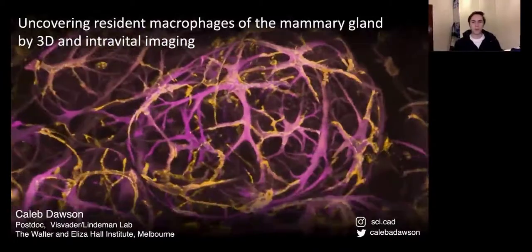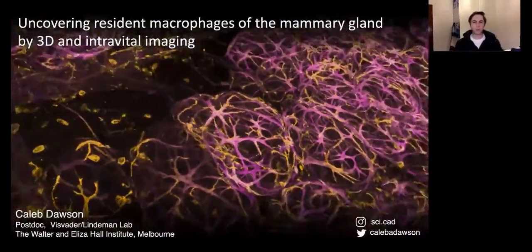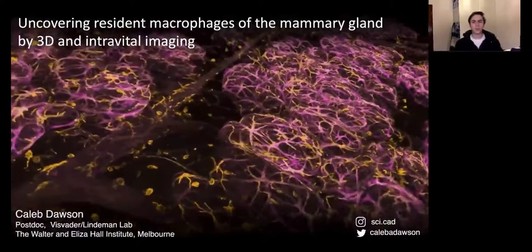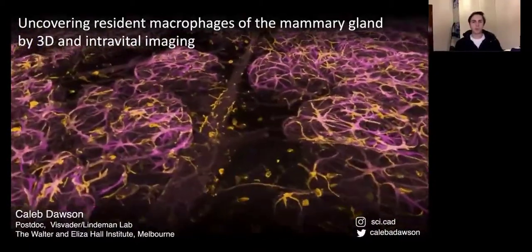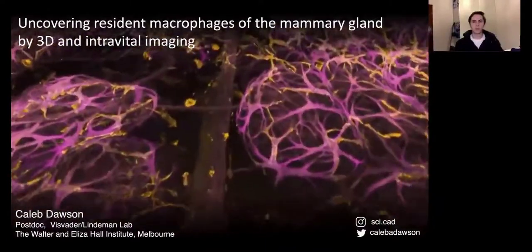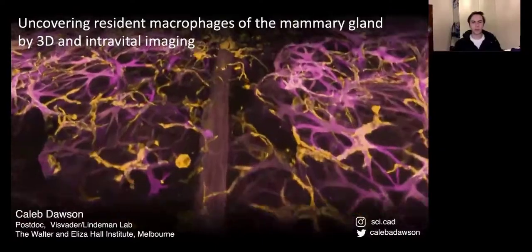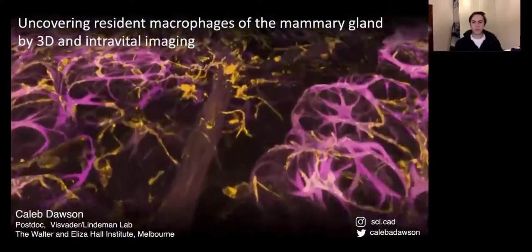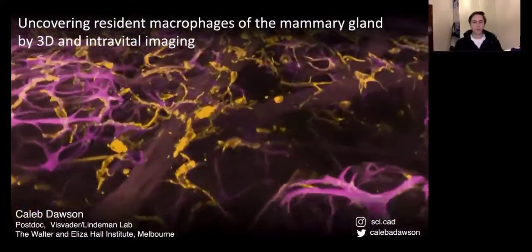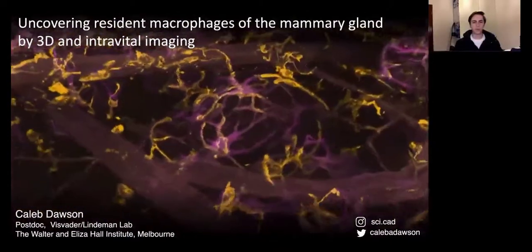I just finished my PhD where I was working on breast stem cells and immune cells using 3D confocal imaging and intravital imaging. So today I'll talk to you about how these led to new insights into resident macrophages of the mammary gland. Please get in touch by Instagram or Twitter so you can ask questions and we can discuss this.